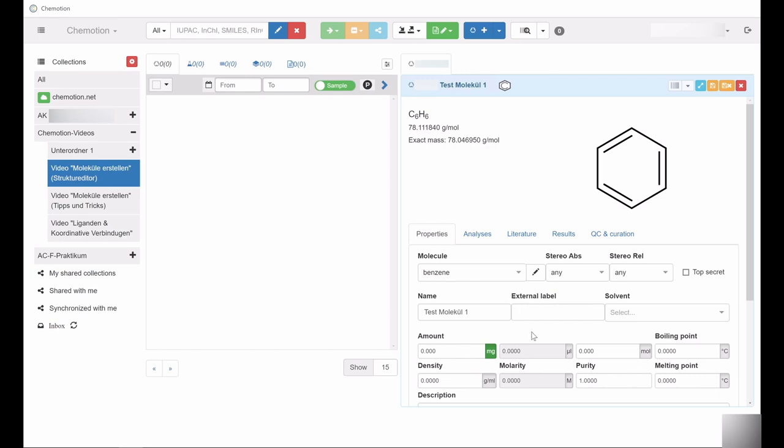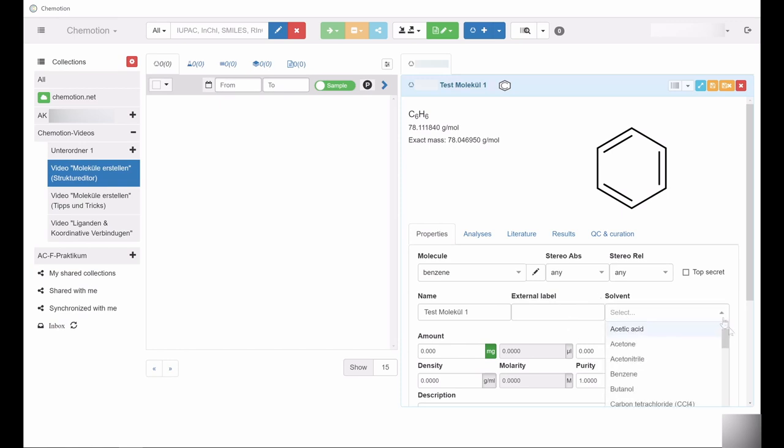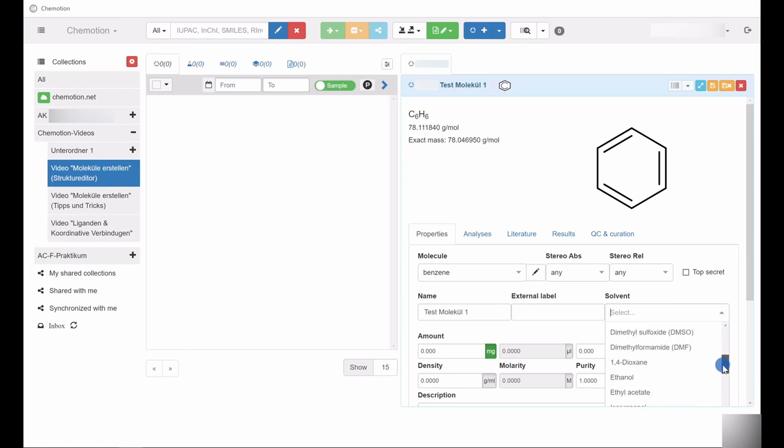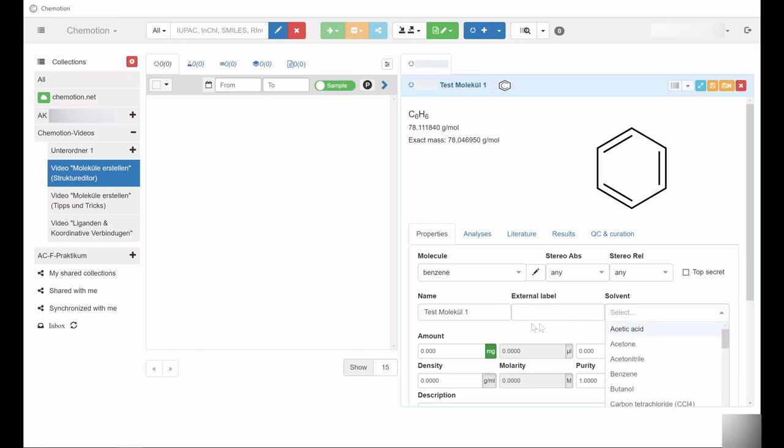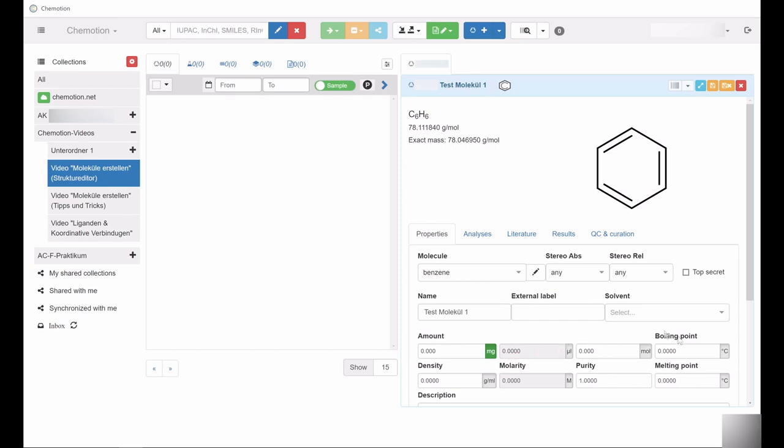You can include additional information such as the solvent and properties such as mass, volume, amount of substance, boiling and melting point, density, molar concentration, and purity.